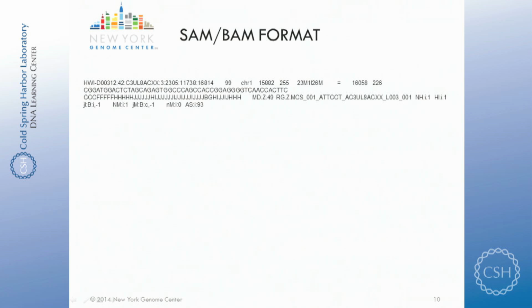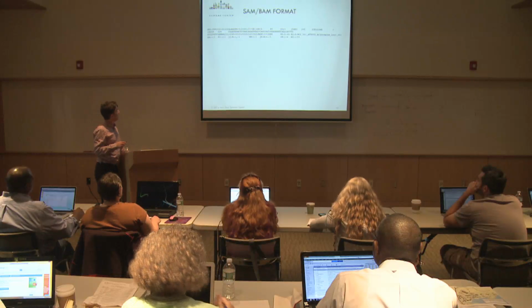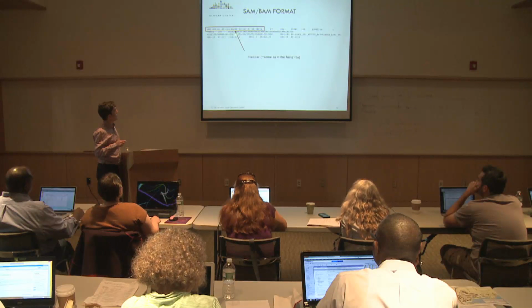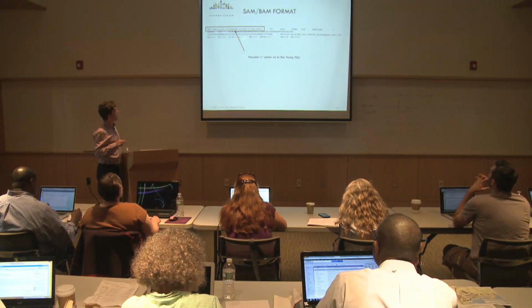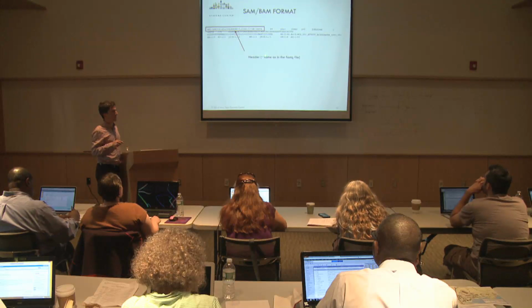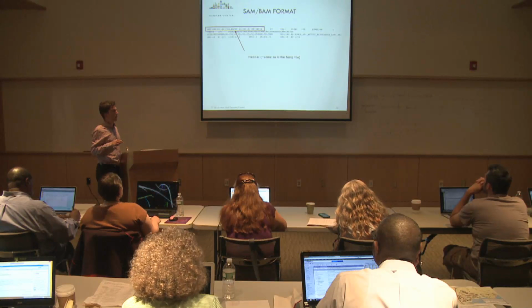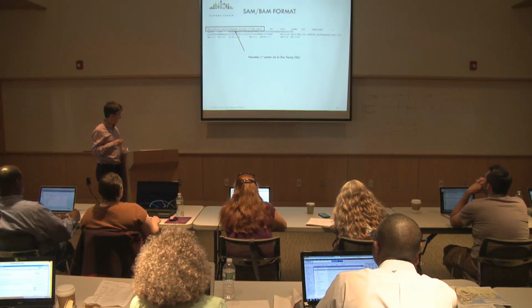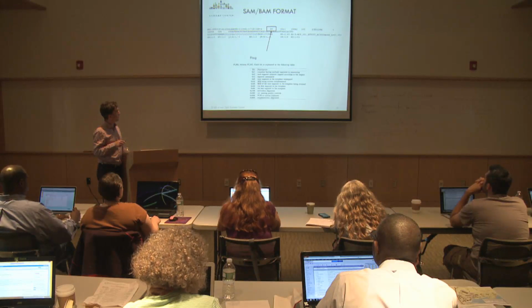Can you go over what you, I'm sorry. Yes, I can. So here maybe you can recognize it. It's the header, and that's exactly the same as we had in the FASTQ file. Okay? So that's just exactly the same information.